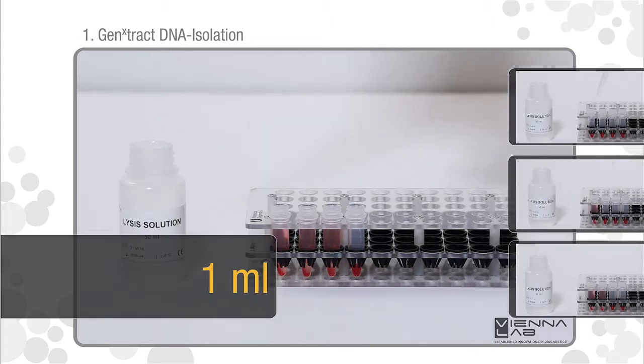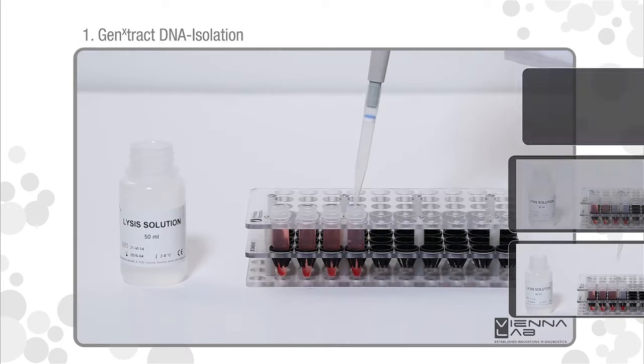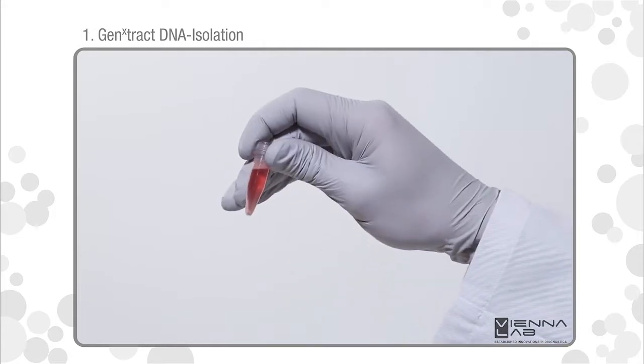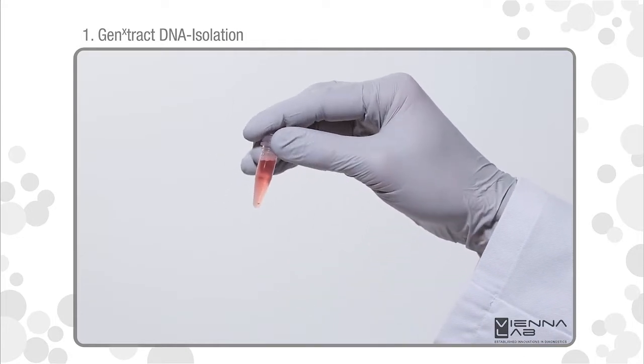Add 1 milliliter lysis solution, close tube and mix by inverting several times. The pellet should be completely resuspended.